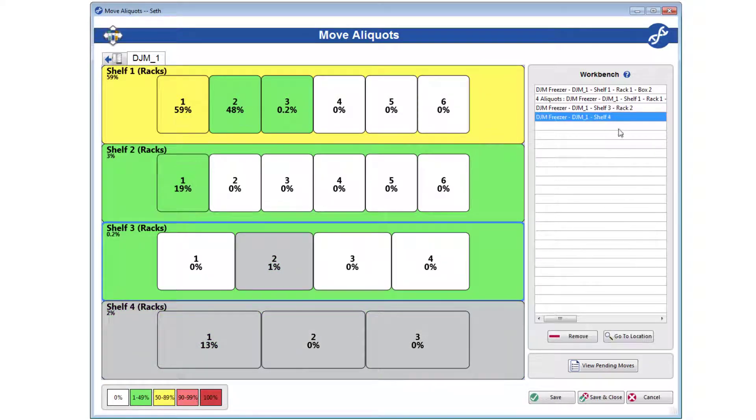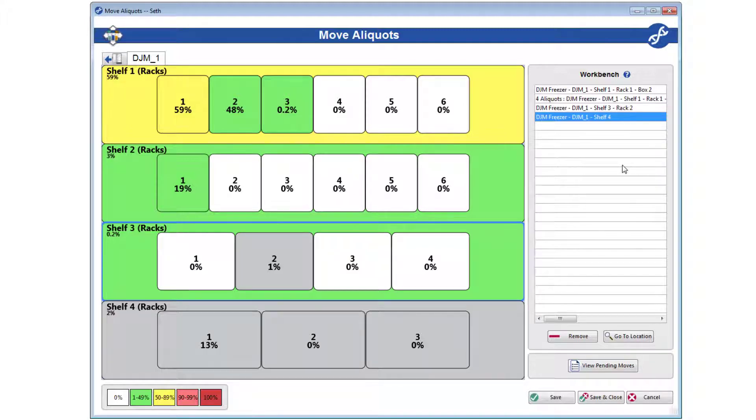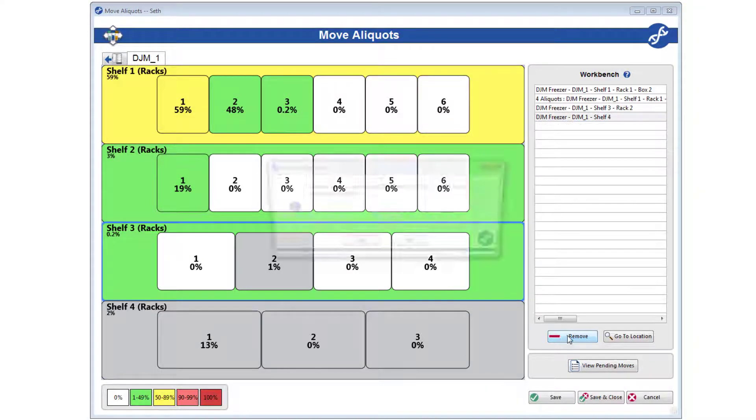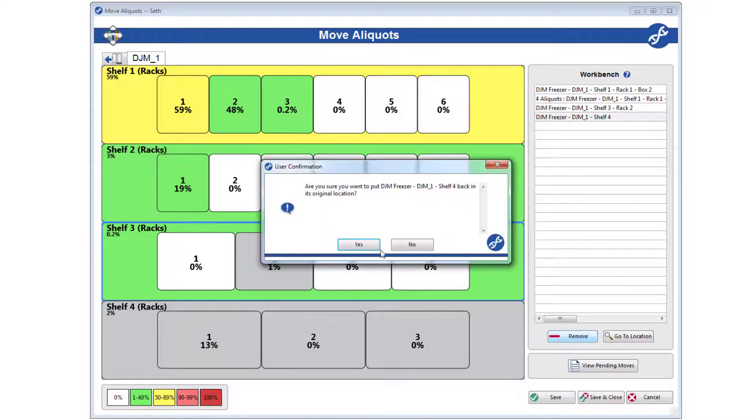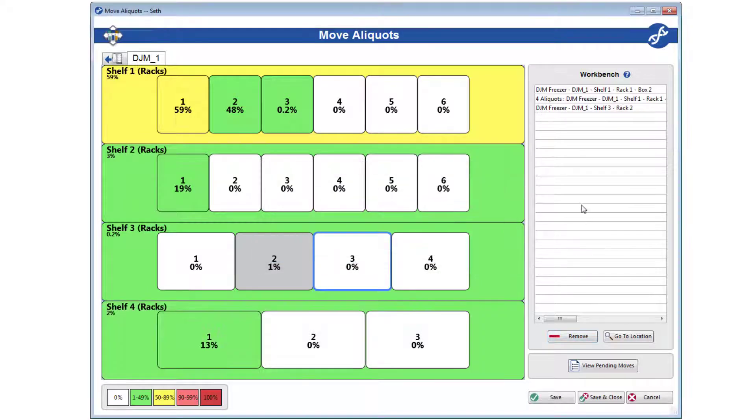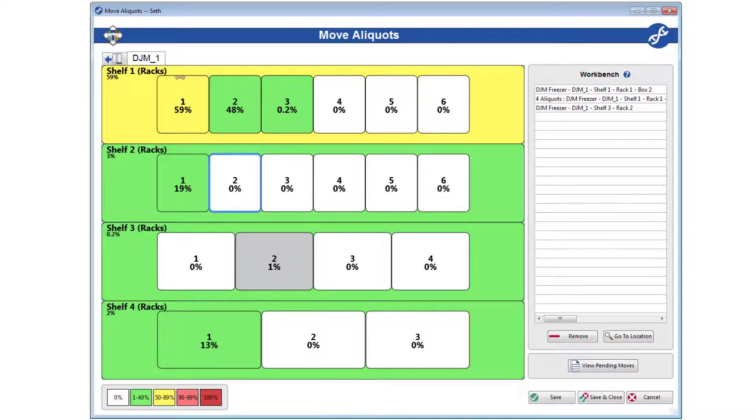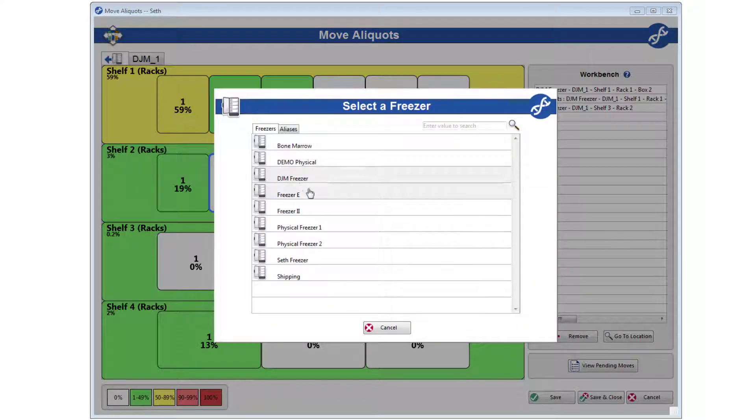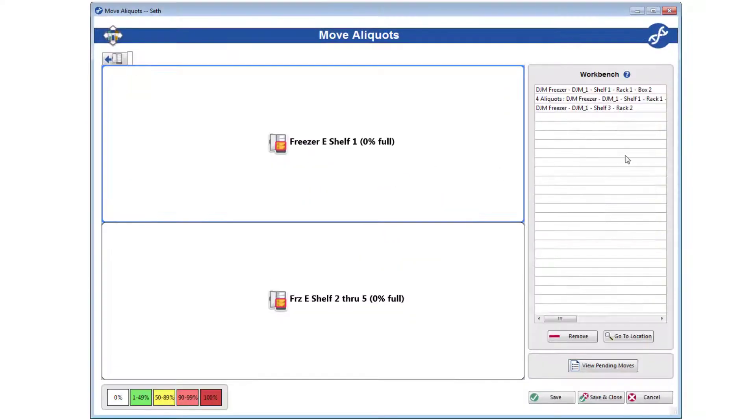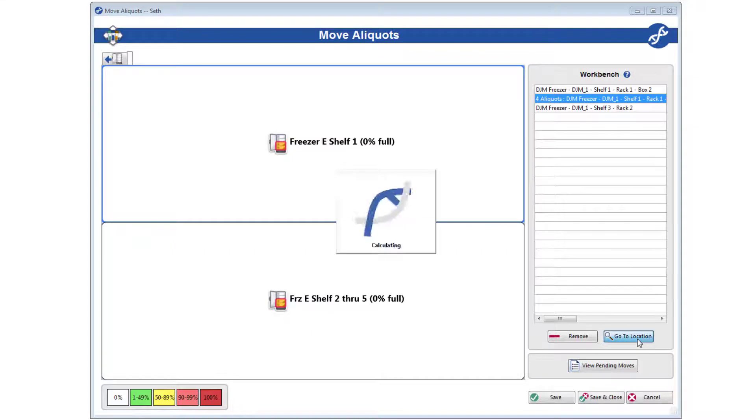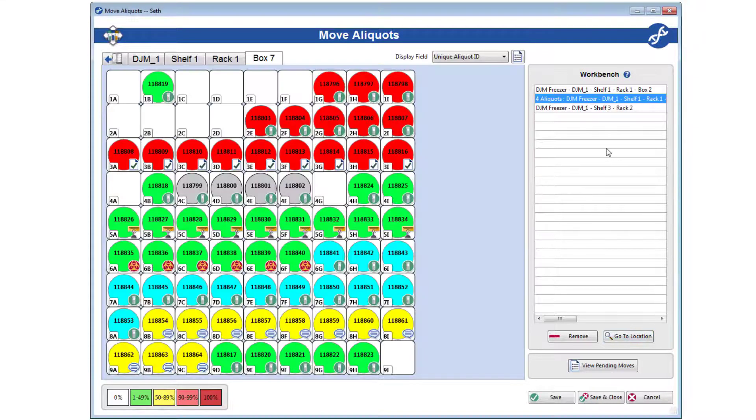If you ever make a mistake and need to return something to its original location, just highlight it in the workbench and click Remove. If you ever need to quickly jump to a location represented on the workbench, say if you've changed freezers or something, highlight it in the workbench and click Go to Location. These two options are also available if you right click a workbench object.